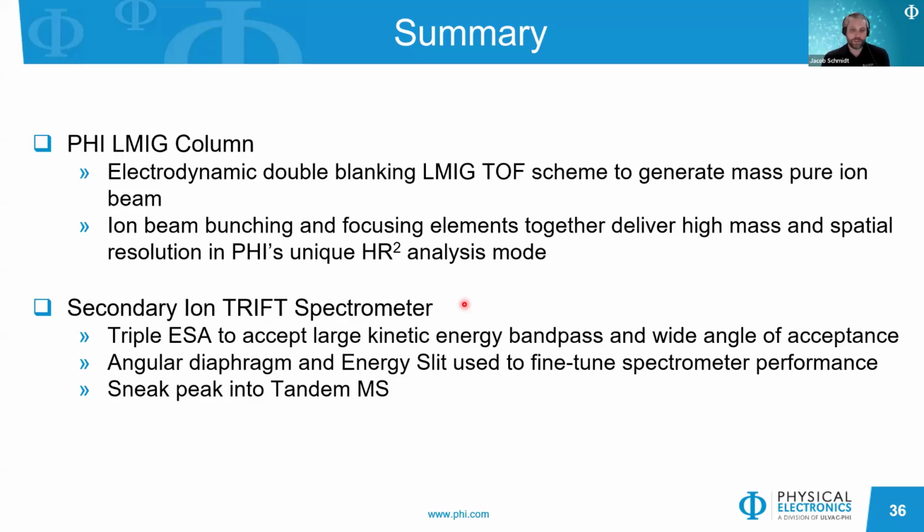We then traveled through the TRIFT spectrometer, a triple ESA spectrometer that can accept large kinetic energy bandpass and a wide angle of acceptance of secondary ions. We learned how the angular diaphragm and energy slit can be used to fine-tune the spectrometer performance, and we had a sneak peek into tandem MS and FIB-TOF technology.